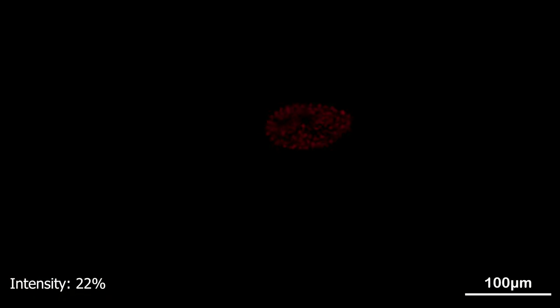Algae usually recover when exposed to such strong light, as they have to face such situations in nature as well.